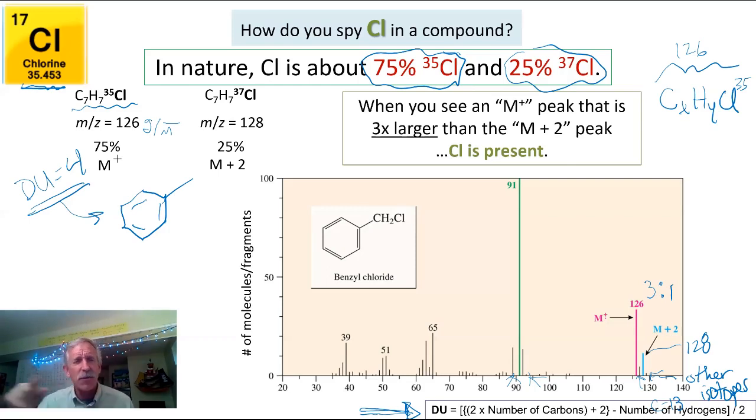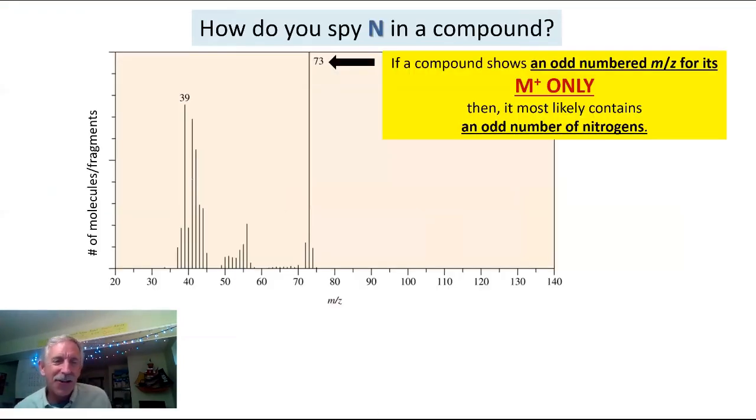4 DUs could be double bonds maybe in a chain, a triple bond and a couple double bonds. As long as you don't have any 5 bonded carbons, you're in business, okay? And that's how we're gonna start using mass spec along with all the rest of our data to try to identify unknowns. It's so fun. It's like a puzzle, and we all love puzzles, right?